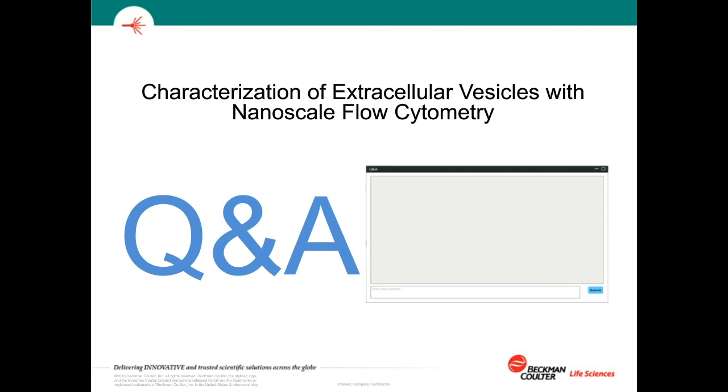Okay, can you label intra-EV markers? Yes, you can, but to label intra-EV, you need to permeabilize the EVs. Some folks in the literature use simple saponin-based detergents, and some people use Triton X and such. But this can be a little complicated because it can increase the noise, so you might need to better purify your samples afterwards. What may be even a little more complicated is there's not a whole lot of intra-EV markers that are available, or at least the interesting ones.